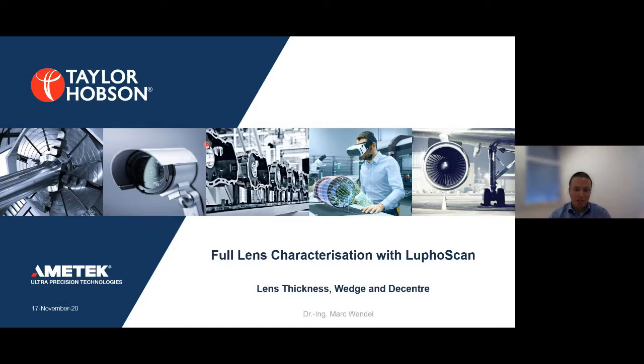Yeah, good morning, everybody. Today we will talk about the full lens characterization with LUPHOScan, as Neil already told you. It's about lens thickness, wedge and Decentre.